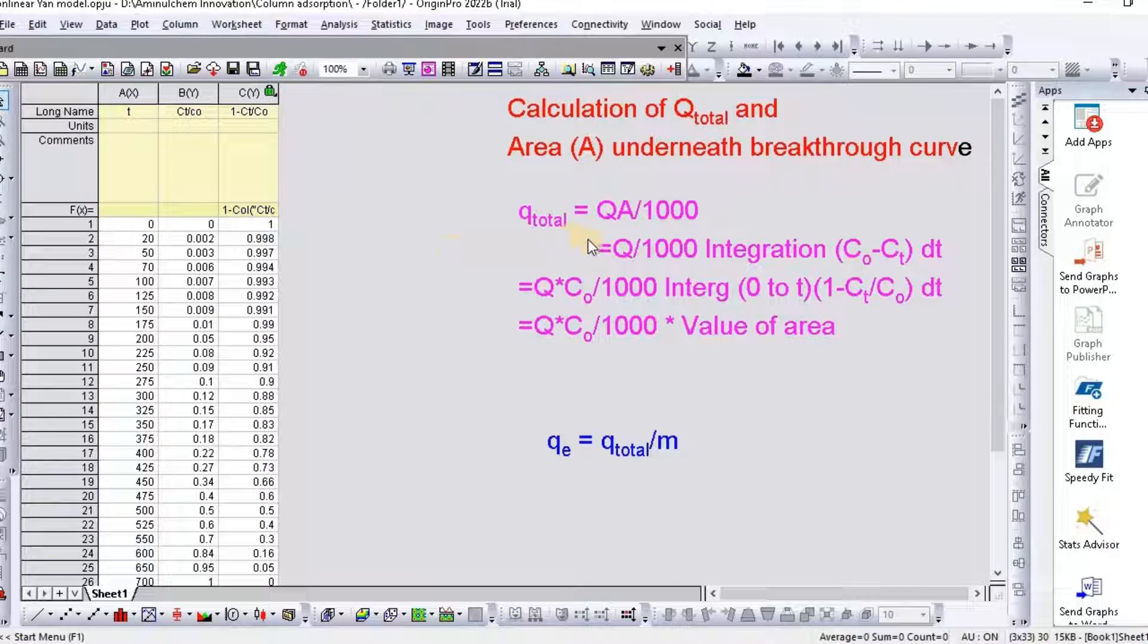While Qt total equal to QA divided by 1000 equal integration 0 to T.